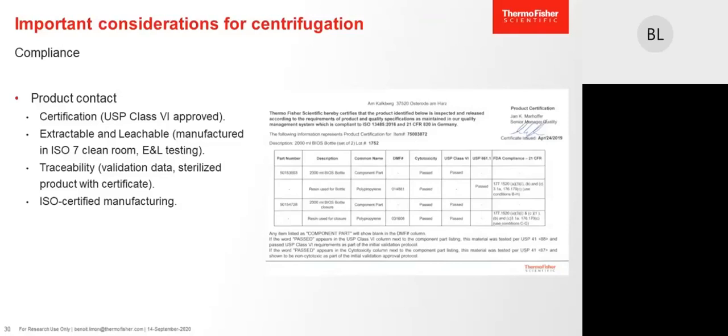So here is shown an example of certification report for product contact container, listing the different guidelines and compliance confirmation.